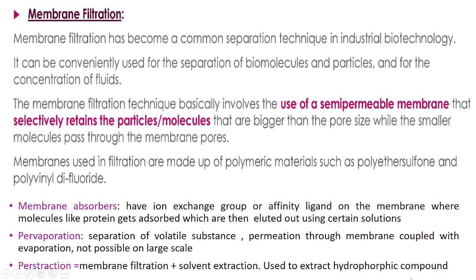Then membrane filtration can be done. Membrane filtration is a very common technique for separation of biomolecules and also for the concentration of the fluid. You'll be using a semi-permeable membrane that retains the particle that you want. The membrane pores will be smaller, and your particle will be bigger than the pores, while the smaller molecules and the water will pass through the membrane pores. The membranes can be made of materials like polyethersulfone and polyvinylidene difluoride.